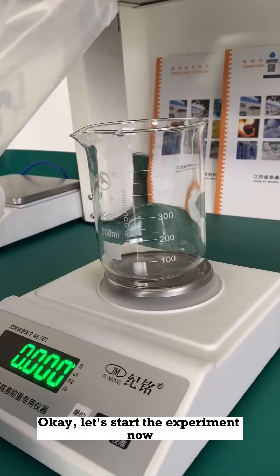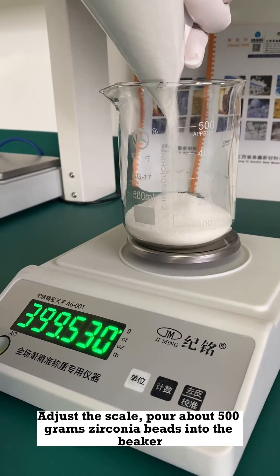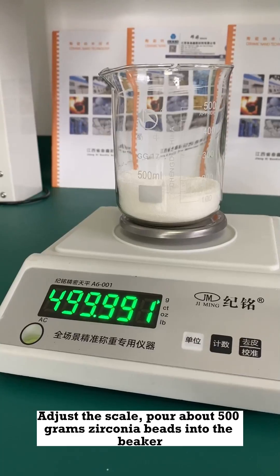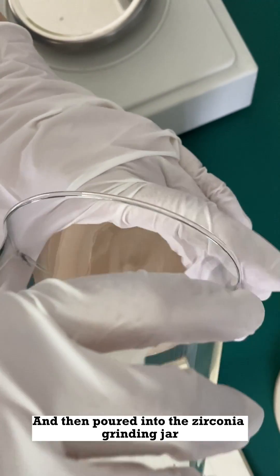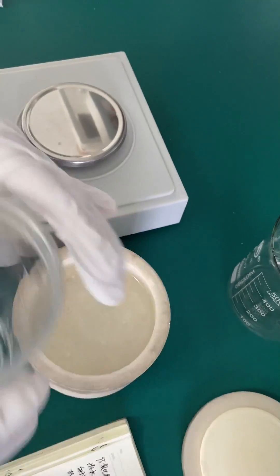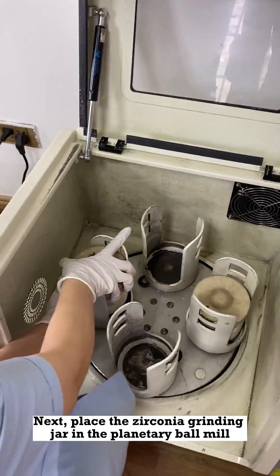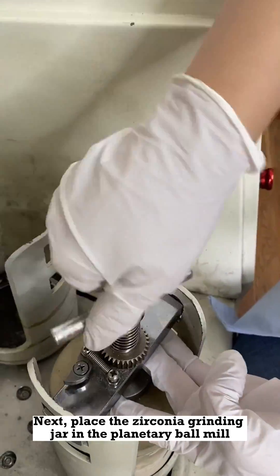Okay, let's start the experiment now. Adjust the scale. Pour about 500 grams of zirconia beads into the beaker and then pour it into the zirconia grinding jar. Weigh about 300 grams of water and put it into the zirconia grinding jar. Next, place the zirconia grinding jar in the planetary ball mill.